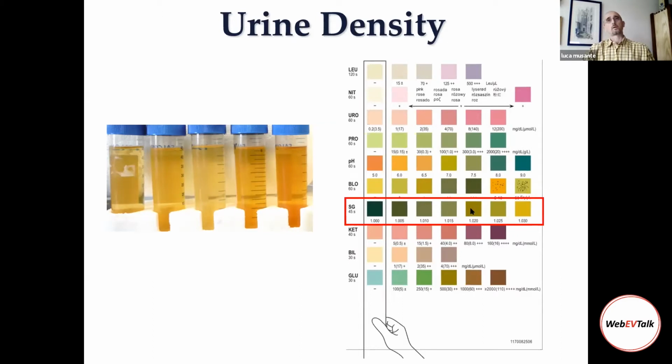Overall, the density is much, much lower than the density of our EVs, but I like to think that working at the nanoscale, small differences, micro differences of samples that are at both ends of the range can have a big impact on the final result.